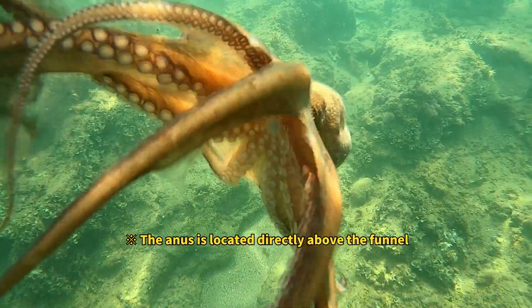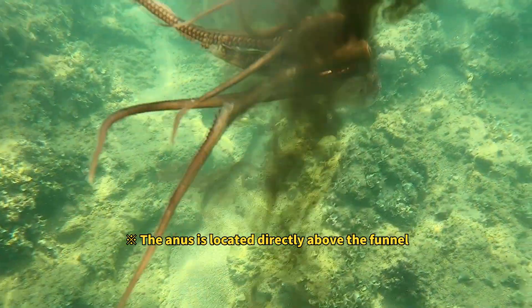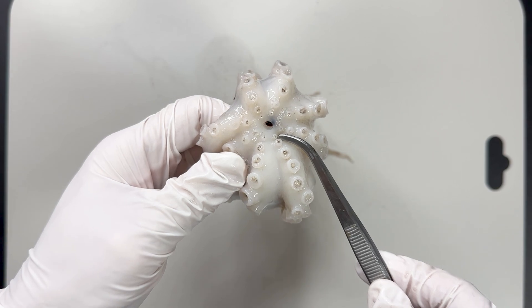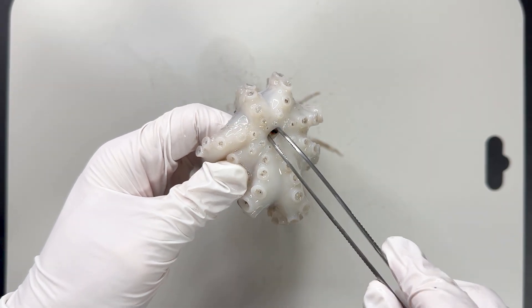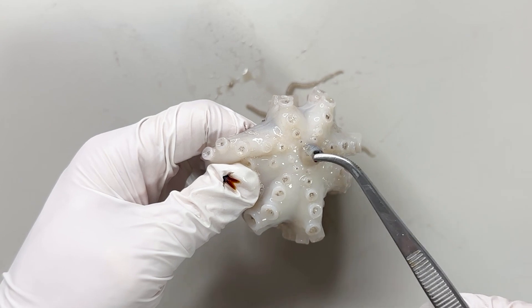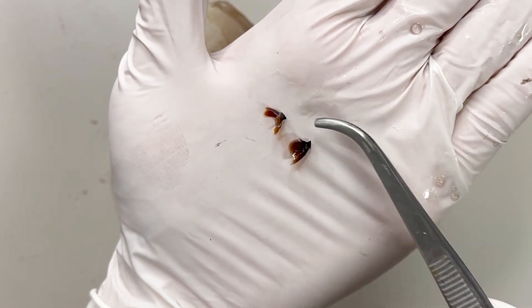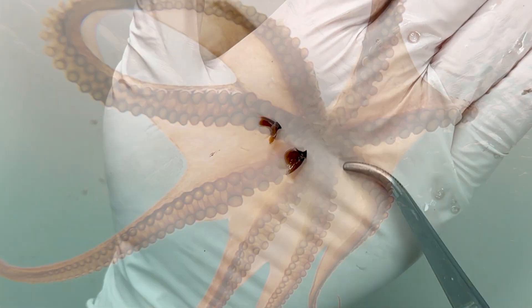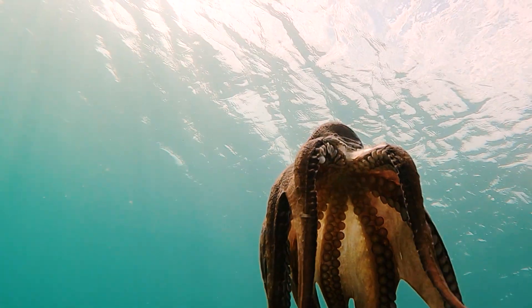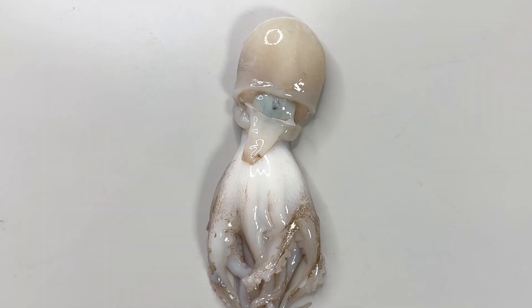The funnel expands to draw in seawater, then narrows to forcefully squirt water out for propulsion or to expel waste and ink. Next, the mouth of the webfoot octopus is located in the center of the arms. Using tweezers to pull it out, you'll see two jaws. Cephalopods use these beak-like jaws to bite and eat food — be careful, sometimes they can bite you.